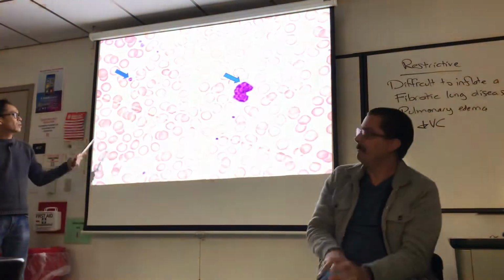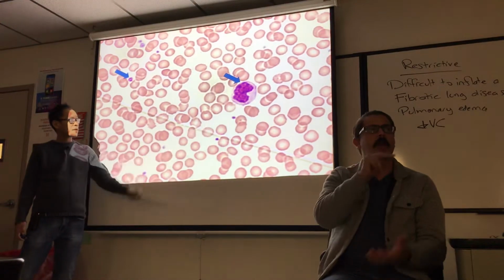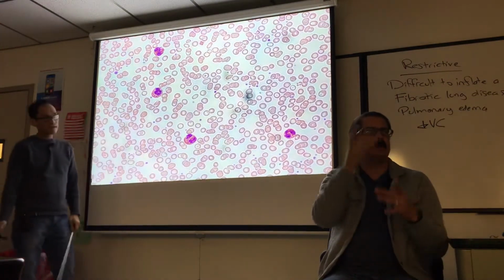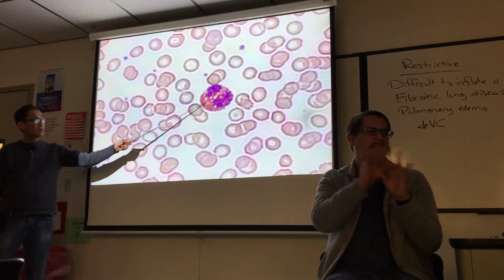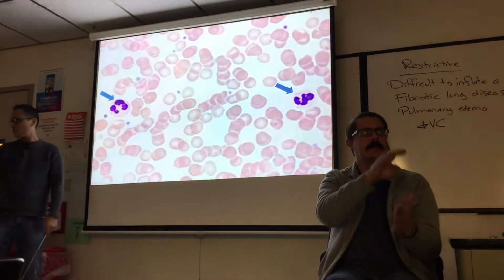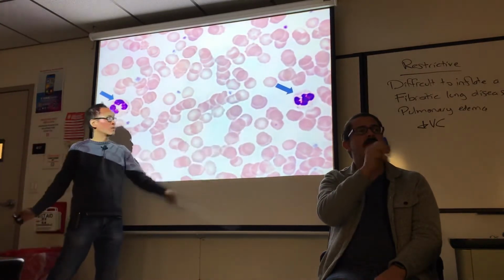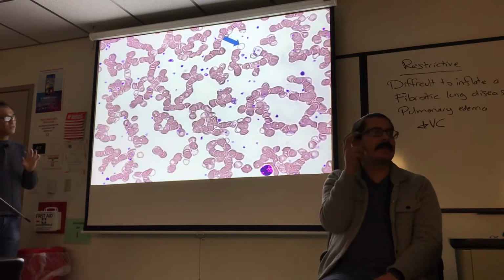I point to a little fragment, platelet, kidney-shaped nucleus. That's monocyte. These are all eosinophils. Okay, this is probably a condition called eosinophilia. Well, that's a little bit out of focus, but I can still see the red granules in the bilobed nucleus. Eosinophil. These are both the same cell type, neutrophil, both of them. Here and here, neutrophil.